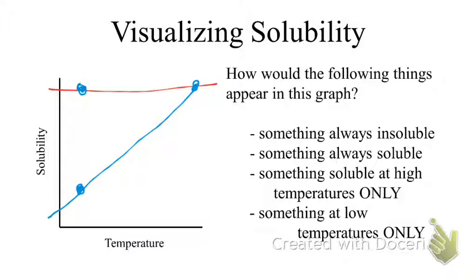What if you'd gone to a high temperature? They'd both be soluble. You wouldn't be able to separate them because they're both dissolved. Okay? So it's a question of interpreting each of these cases and trying to align them as best you can. What's the easiest way to separate a solution from our now insoluble target? Filter. Okay? Kind of makes sense?